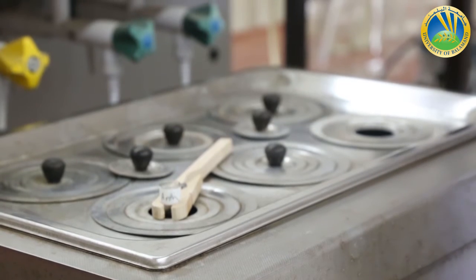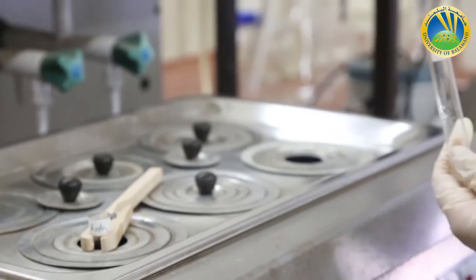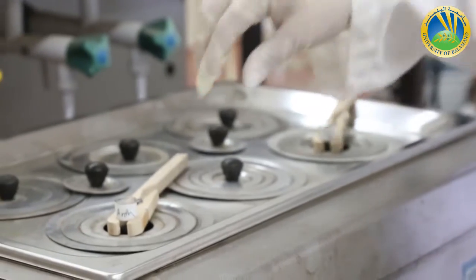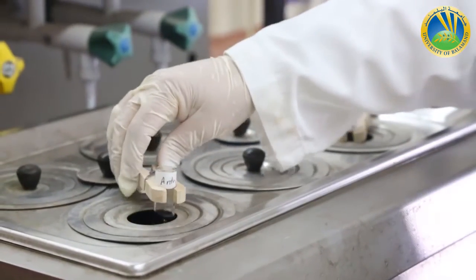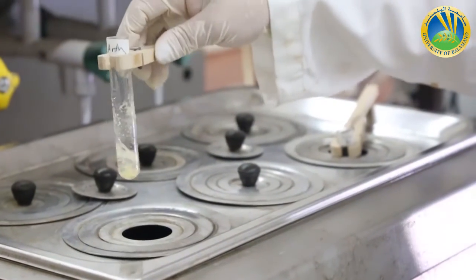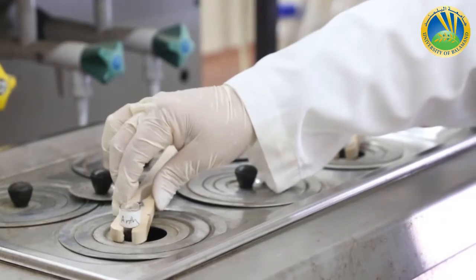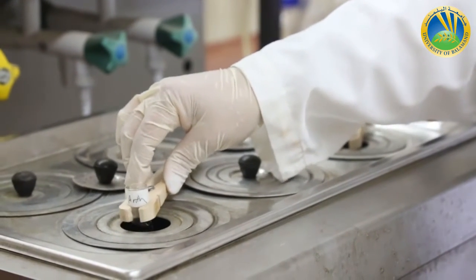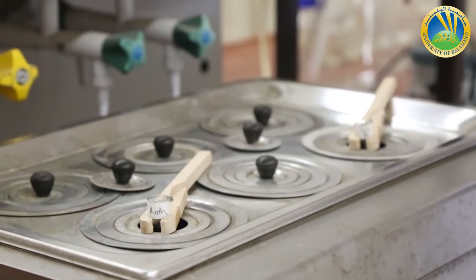I will test stearic acid. I will put it here. So let me check anthracene. Anthracene seems not to be soluble at hot. I will leave it for a few more seconds.